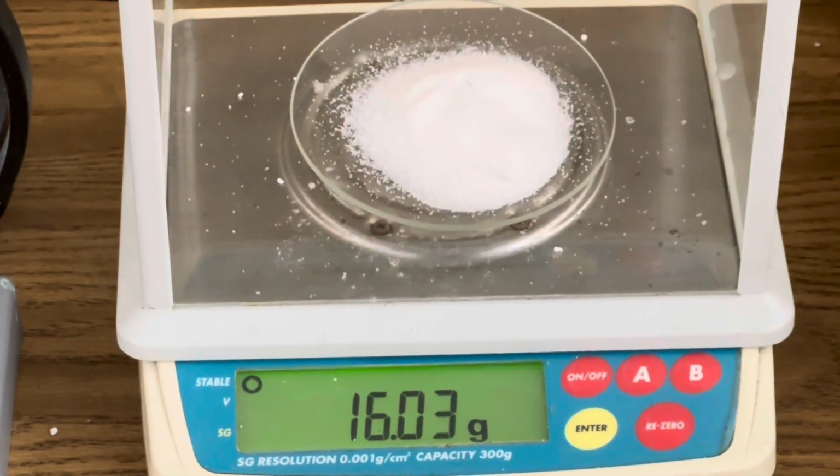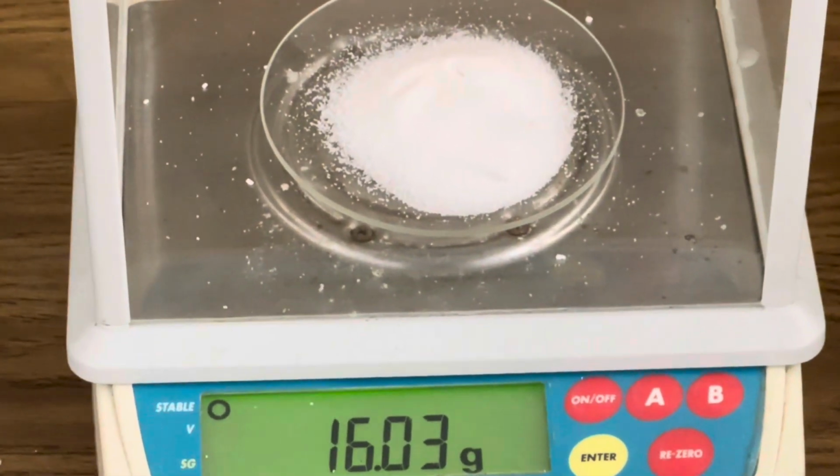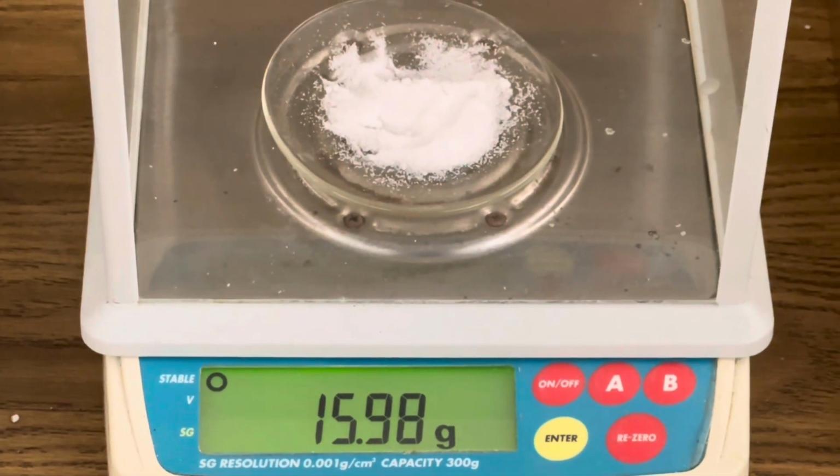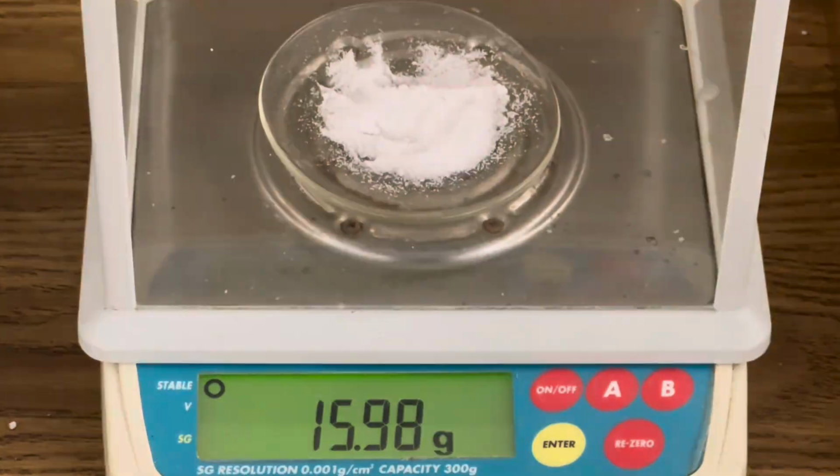Measure out another 16 grams of granulated sucrose. And then finally measure out another 16 grams of strontium nitrate.